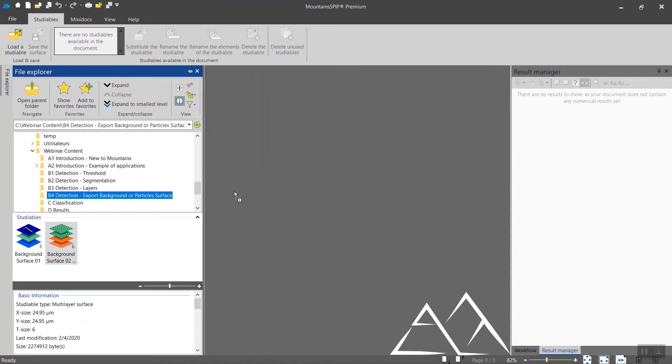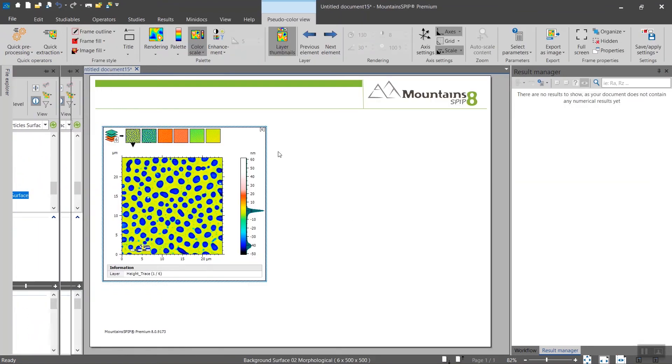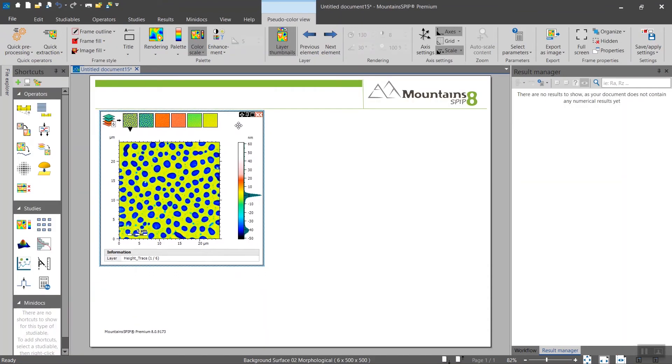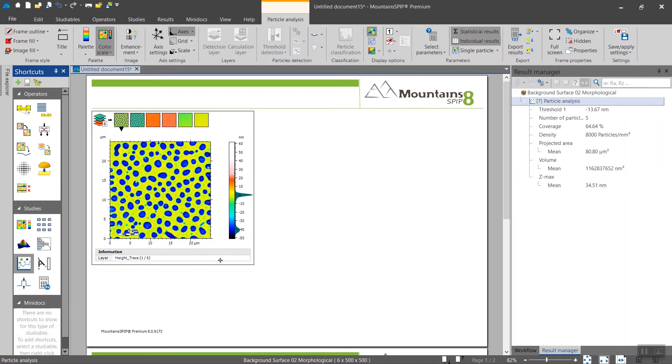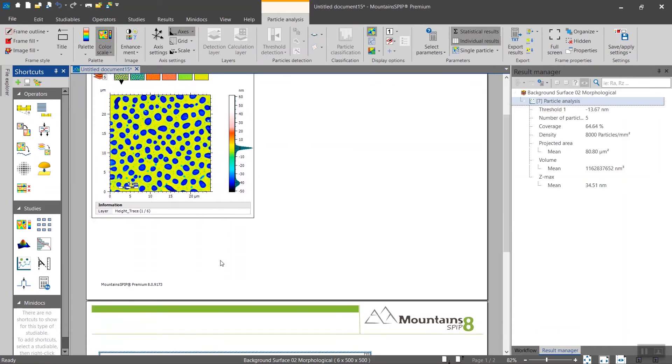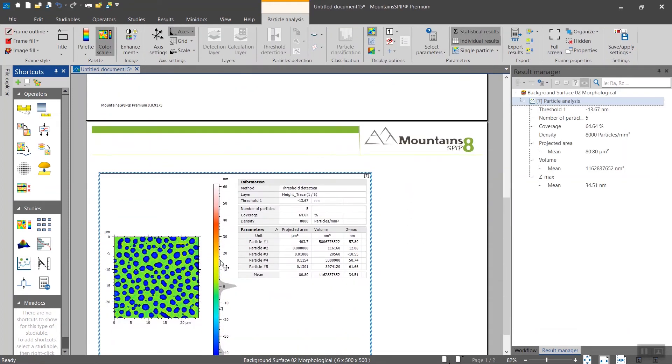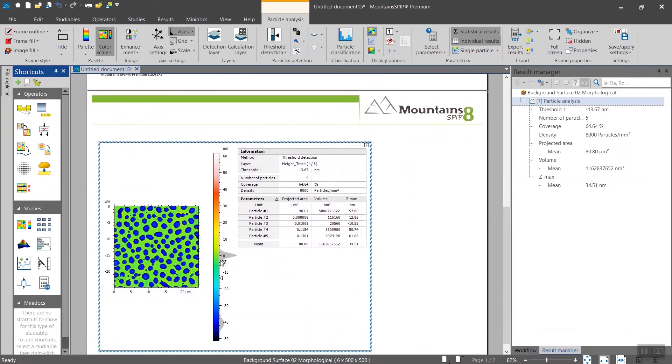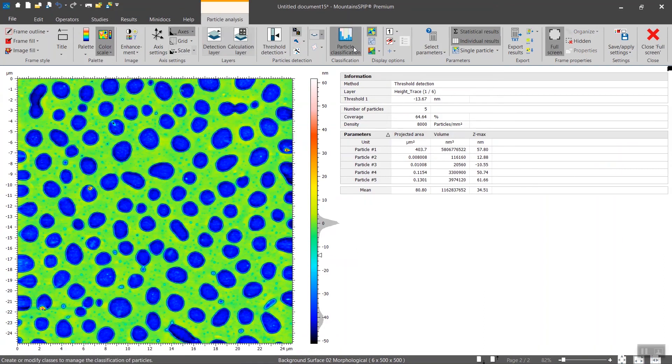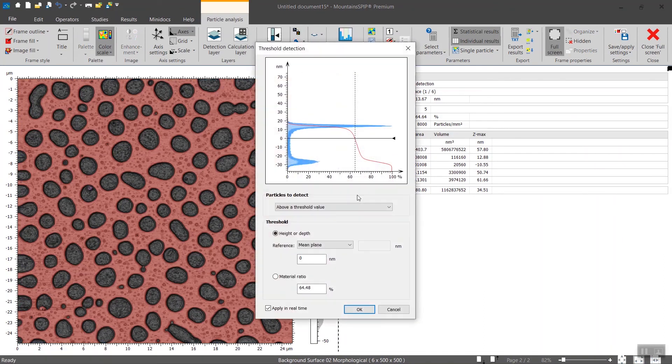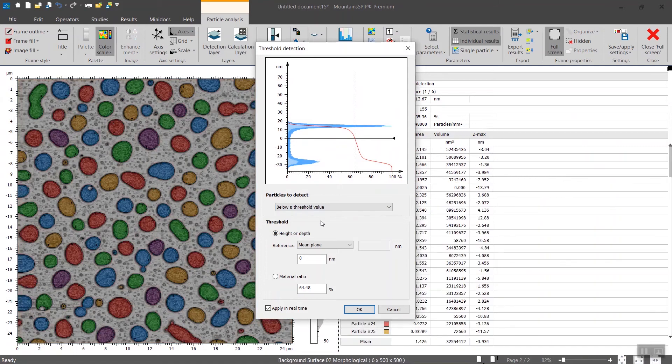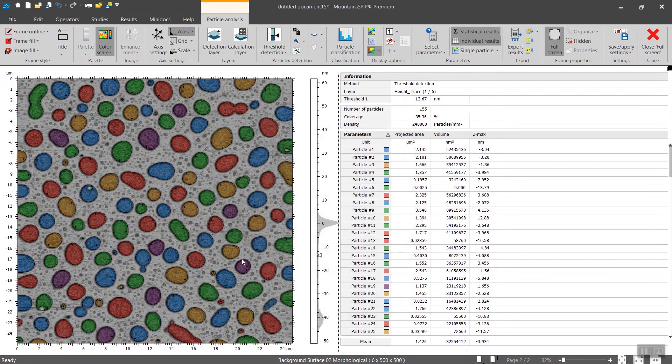Here's another example where you want to first highlight structures and then remove them, mask them for further processing. So let's play with this example. Very quickly we use the particle study. This view we will change from above to below, then we click on okay.